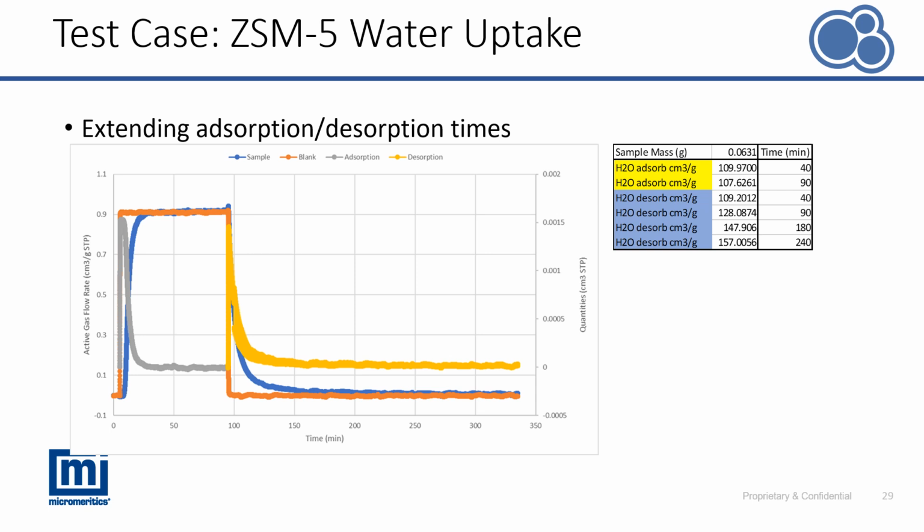The previous data shows integration up to 40 minutes. Here, the adsorption and desorption windows were extended even further. Comparing the 40-minute window and the 90-minute window, the adsorption values were quite similar. When extending the desorption, the quantities desorbed appeared to increase quite drastically, especially if the time was extended. The integration and comparative method here has some limitations. Cumulative errors may be problematic, and for samples that have a slow uptake or slow desorption, it can be significant if the times are significantly extended.